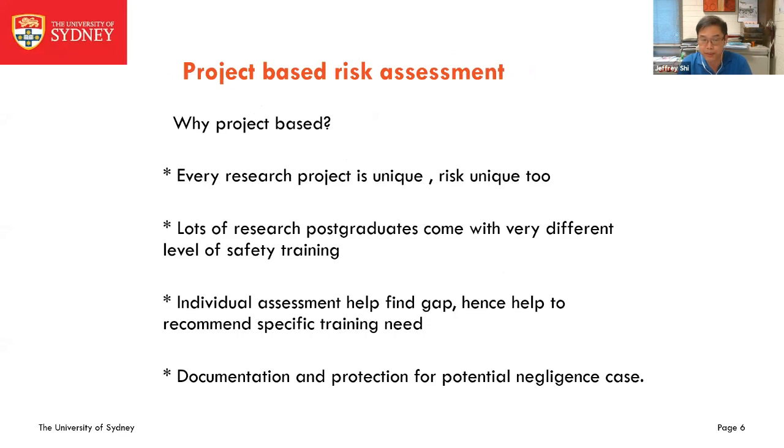So why project-based risk assessment? Because universities do various research, some of them very unique, and some of the risk level is unique. Our academics always try to push the envelope to compete for new talent across the world. When you go to that type of area, some of the risk is unknown. So every research project is unique. We have to do a proper risk assessment based on that type of research project.